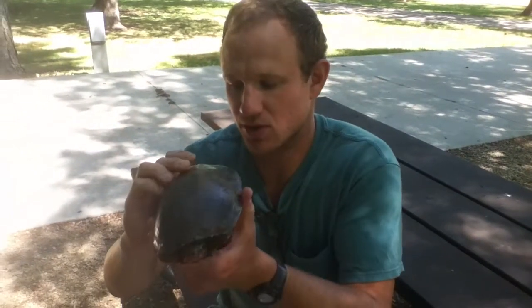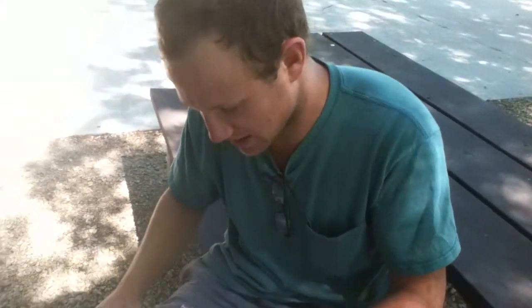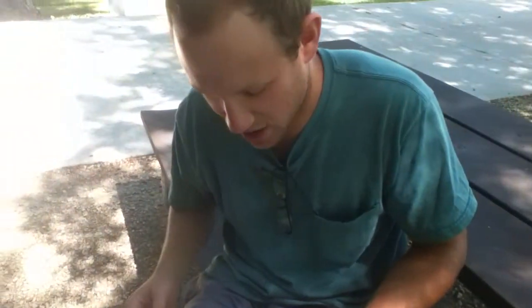I'm going to show you today how we get blood samples from our painted turtles. This technique works for pretty much any turtle. We take the blood sample out of the tail, so I sit the turtle down head first in a towel between my thighs and hold her there so if she struggles she can't scratch me.